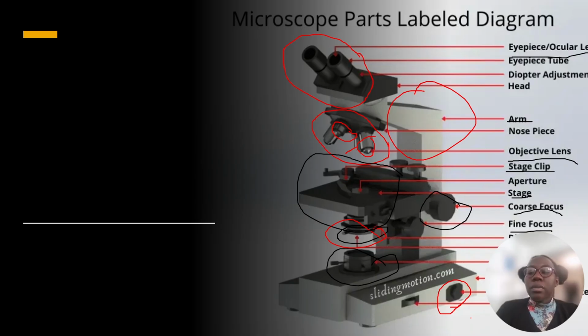And here we have the fine focus, or fine knob. It helps you to actually see, but if you're moving it without looking through the microscope or without looking at a specimen, you cannot see its function. You have to be watching and adjusting at the same time, and then you will see that the fine focus allows you to see more clearly what you're watching.